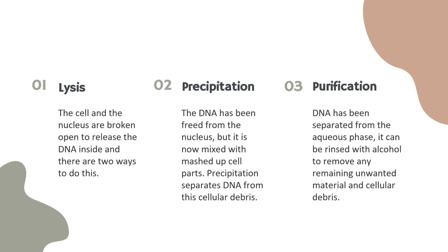And the last step, which is purification. In this step, now that DNA has been separated from the aqueous phase, it can be rinsed with alcohol to remove any remaining unwanted material and cellular debris. At this point, the purified DNA is usually redissolved in water for easy handling and storage.